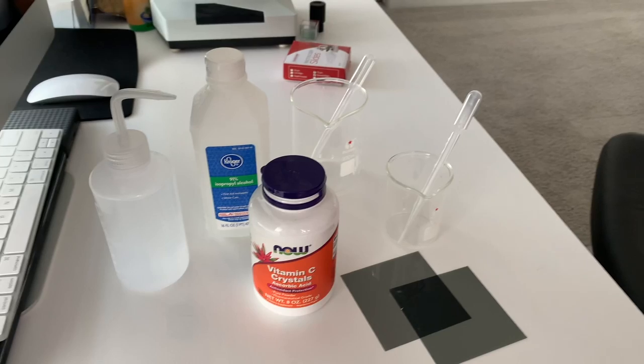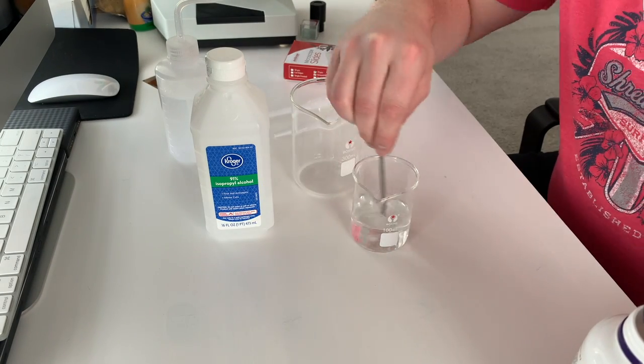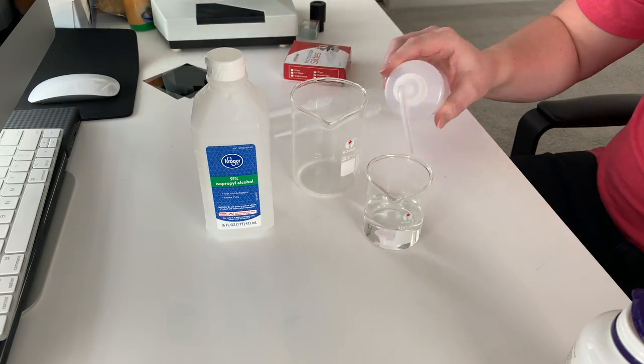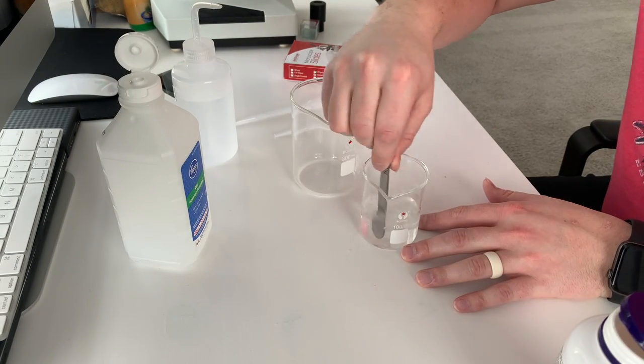Specifically, we're going to be growing some vitamin C crystals, and I'll walk you through the steps of how I did it. If you want to do this experiment, you'll need some vitamin C crystals — get the most pure stuff you can find — some distilled water, and you could also use some isopropyl alcohol. That just helps things dissolve a little bit quicker and also helps things dry a lot more quickly as well.